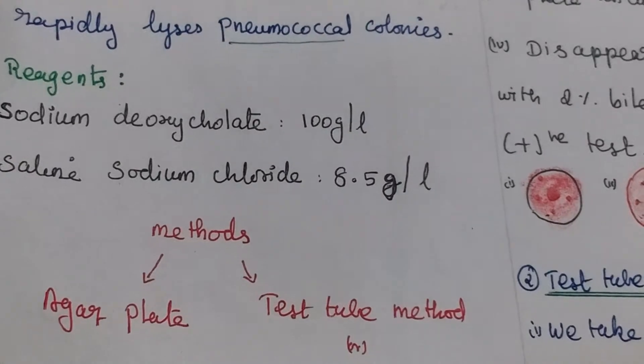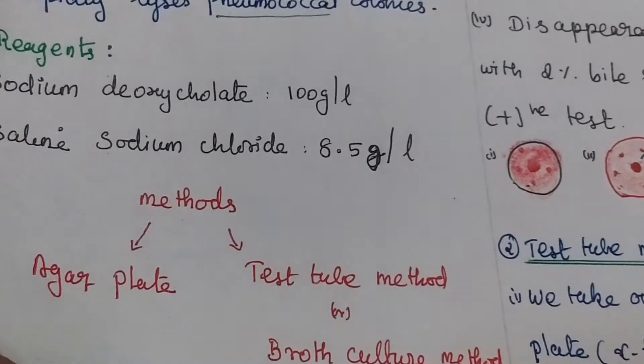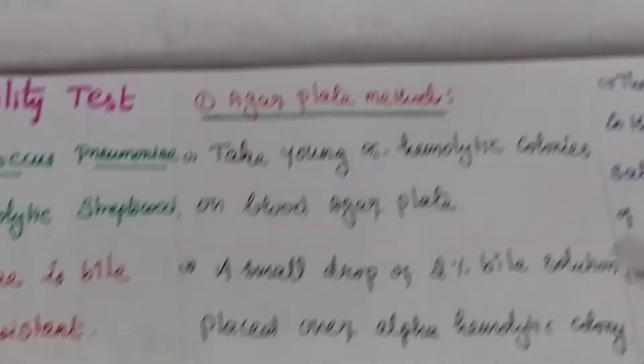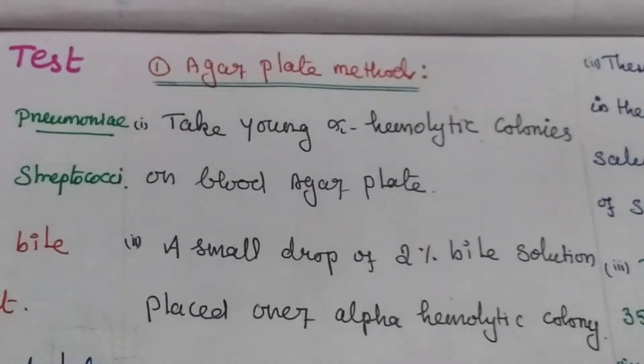Two methods we are using: agar plate method and test tube method. Now we see the agar plate method.